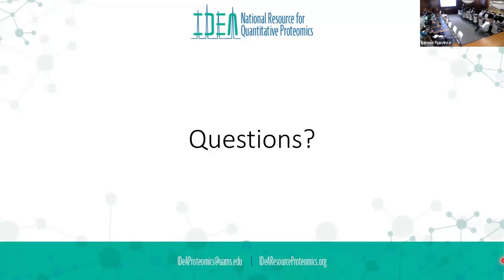I have a question. If we need to see post-translational modifications like ubiquitination and acetylation, do we also use just the TMT method? I think so. I mean, that works reasonably well.